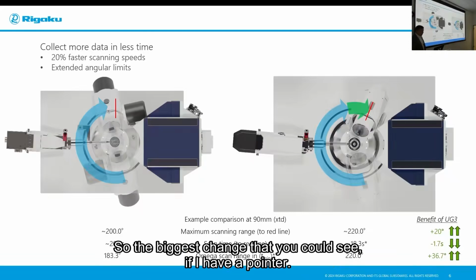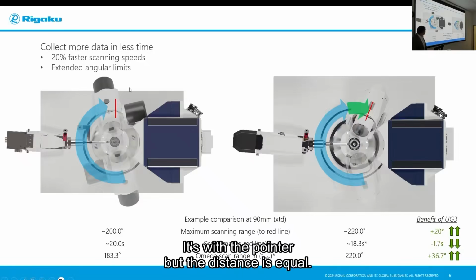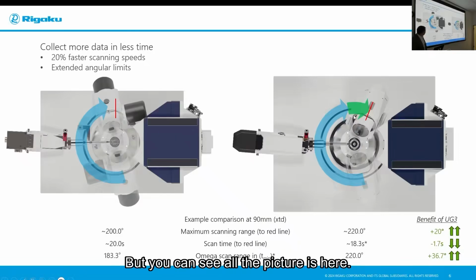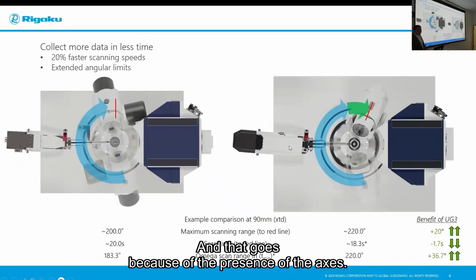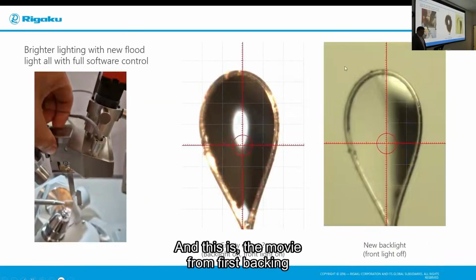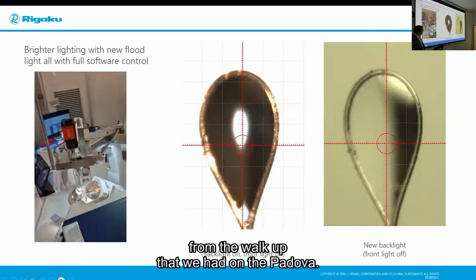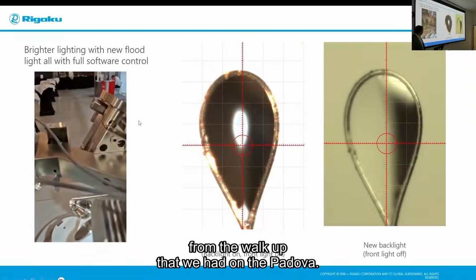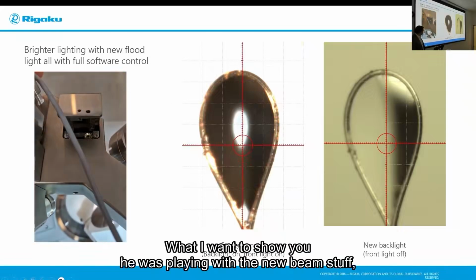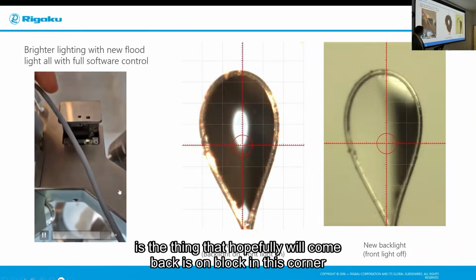So the biggest change that you can see, if I have a pointer, probably not. Yeah, I can switch to the pointer, but the biggest change is probably you can see on the picture is here, and that goes because of the presence of the arcs of our goniometer. And this is the movie from Chris making from the mock-up that we had on the Padova. What I want to show, he was playing with the new beam stop, but what I want to show you is the thing that hopefully will come back is on loop.